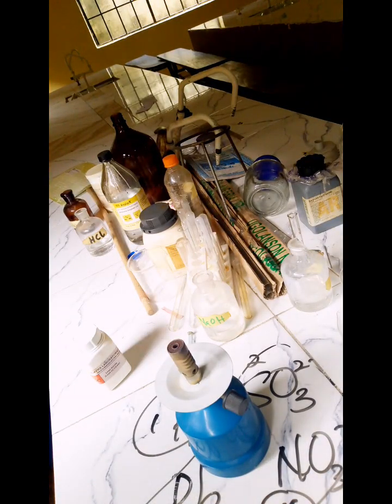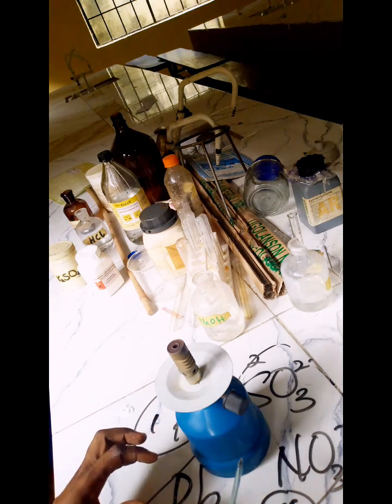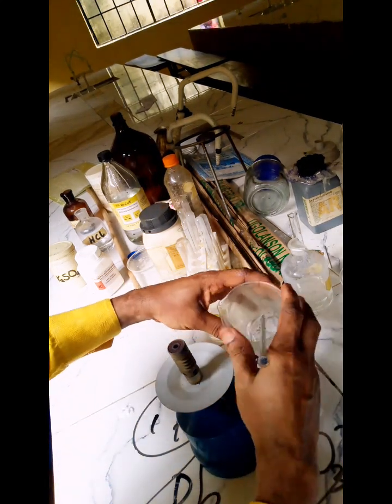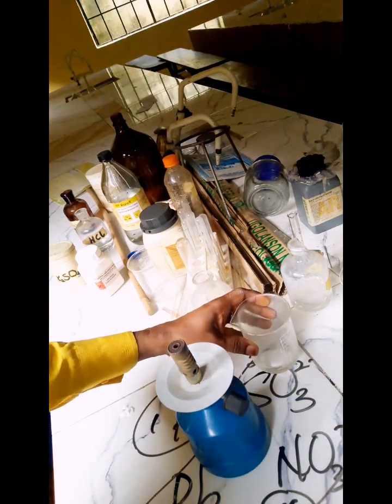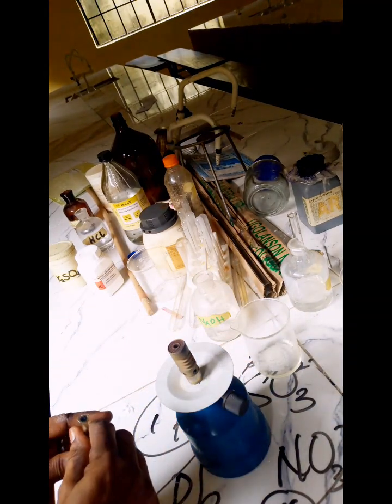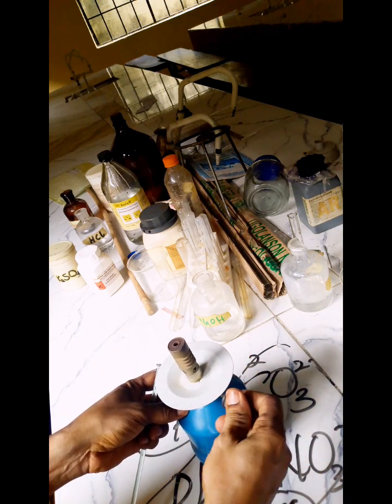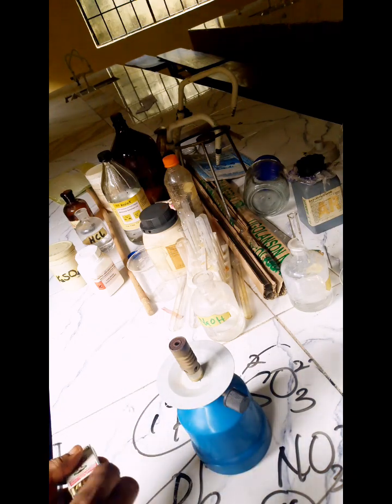Then let's quickly test with the flame and see what the outcome will be. This is a glass rod. Let's dip the glass rod into the concentrated hydrochloric acid. All right, let's ignite the flame.